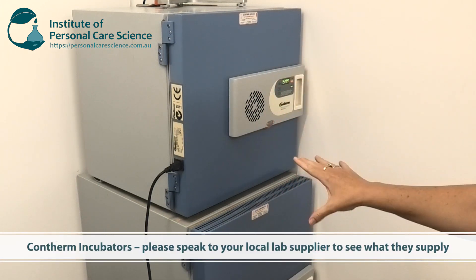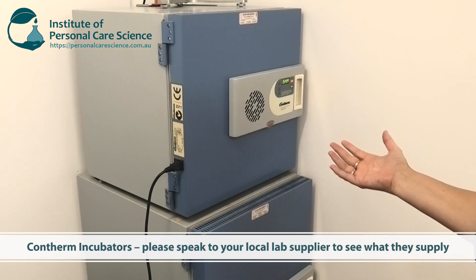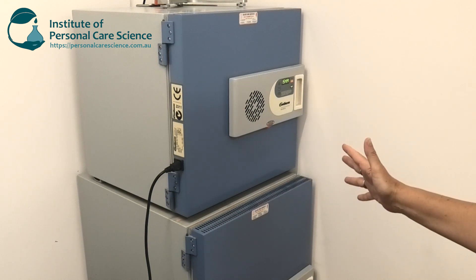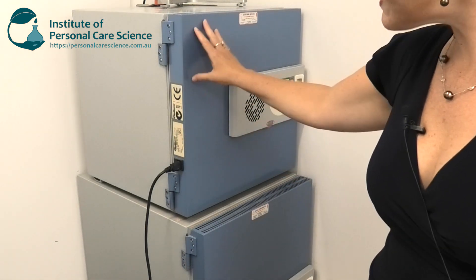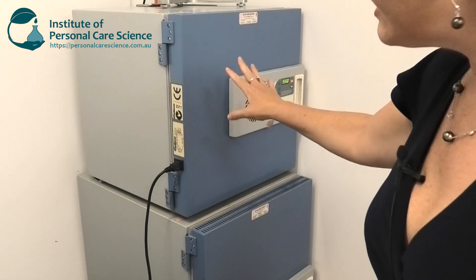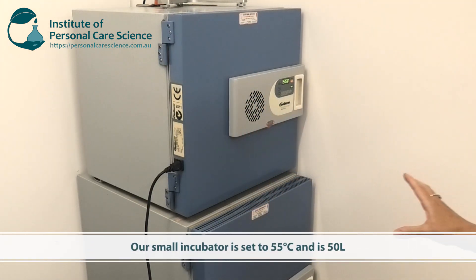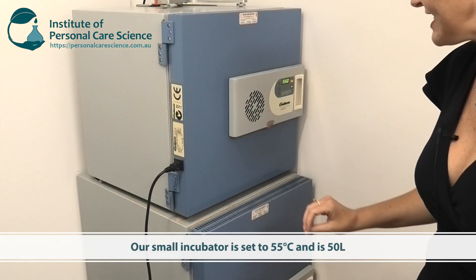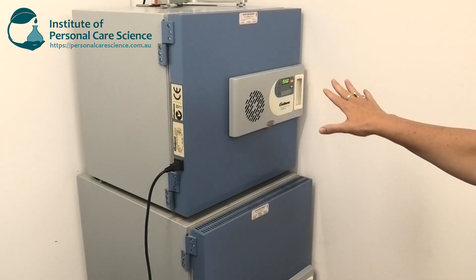I've picked this size because we conduct stability testing for companies, so we do have times where we have a lot of samples in there. This top one, as you can see from the size of me, is about twice the size of a normal microwave. You can get this sort of incubator about the size of a microwave, which for small brands would be plenty big enough for most of your stability testing needs. This one is set to 55 degrees.